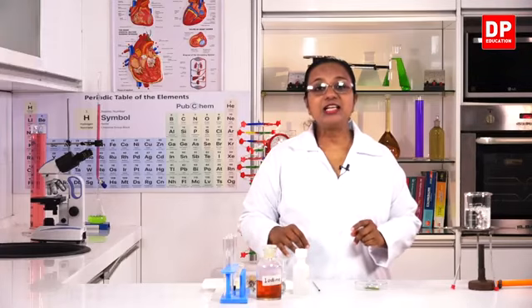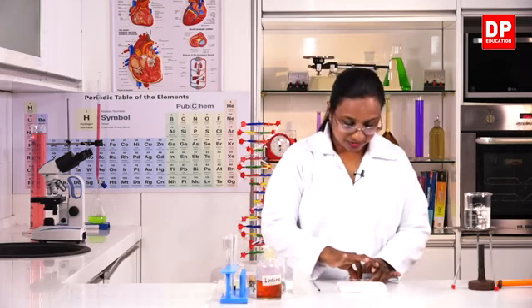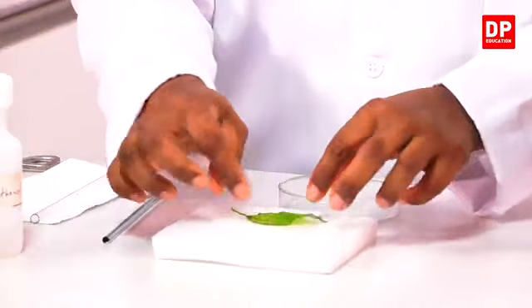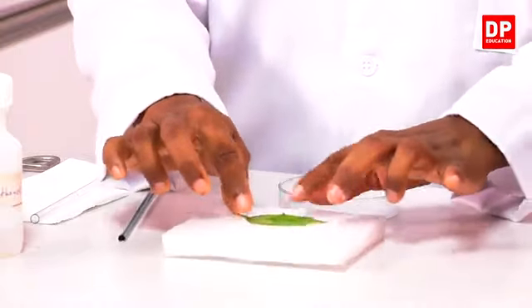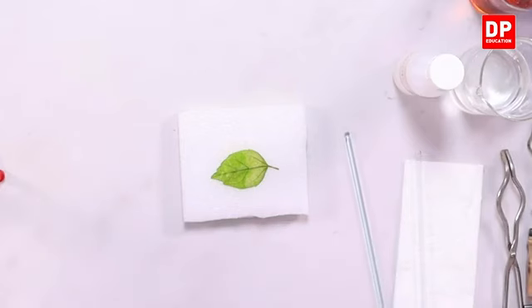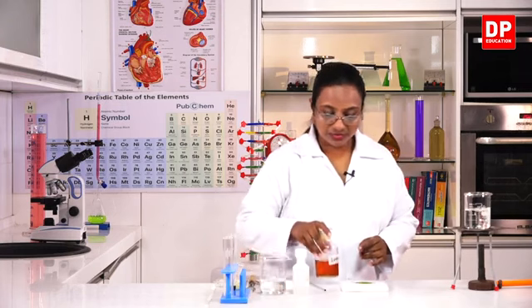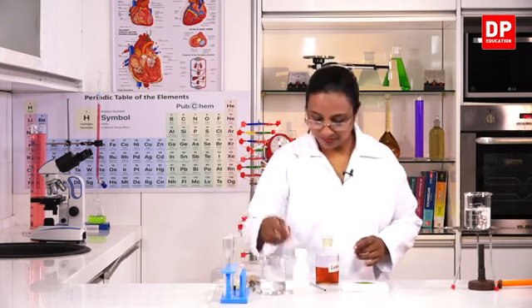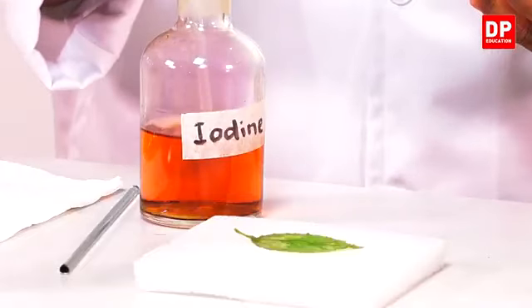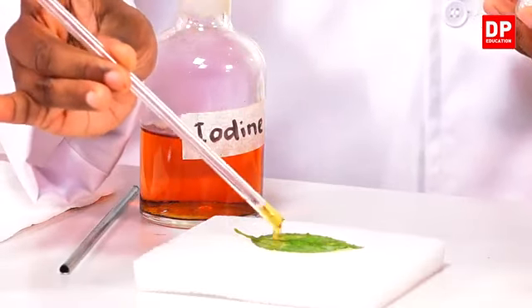So to see the color change clearly, I will transfer the leaf onto this piece of sponge. So now you can see the color of the leaf clearly, and you can see this region where the color is very light. That means most of the chlorophyll has been removed from that region. Now using the glass tube, I will put a small amount of iodine onto the leaf.